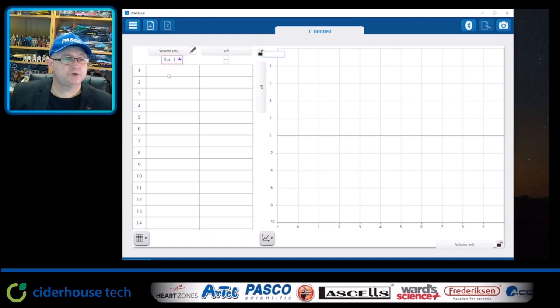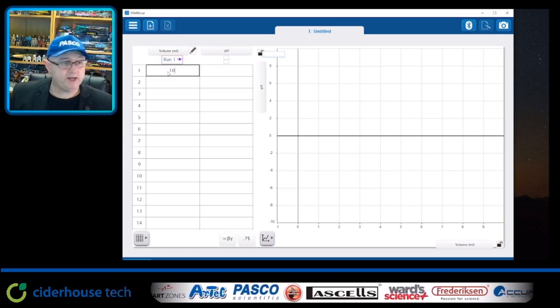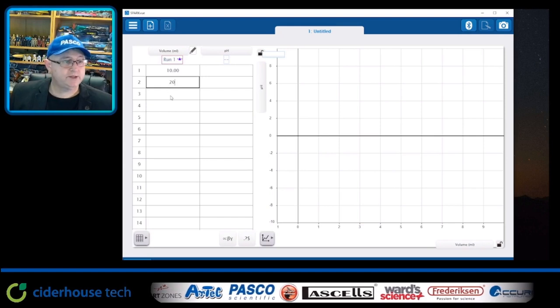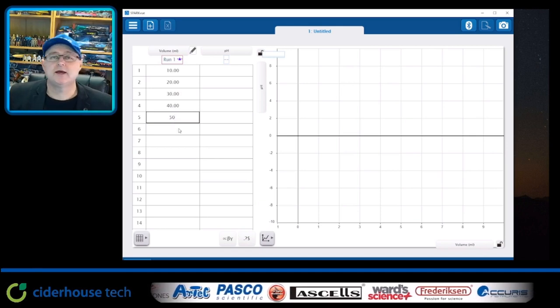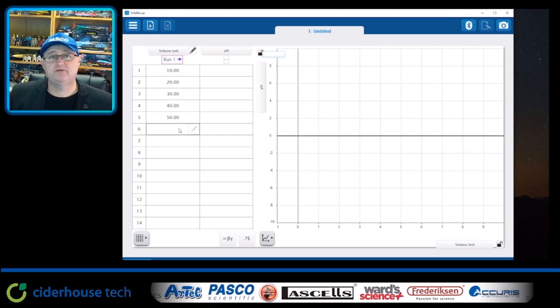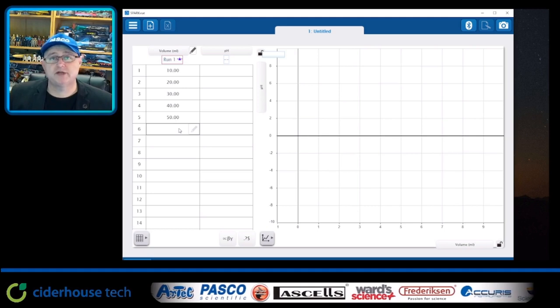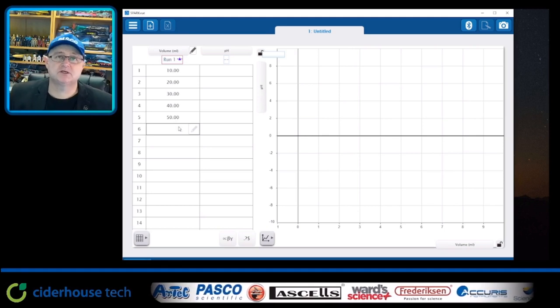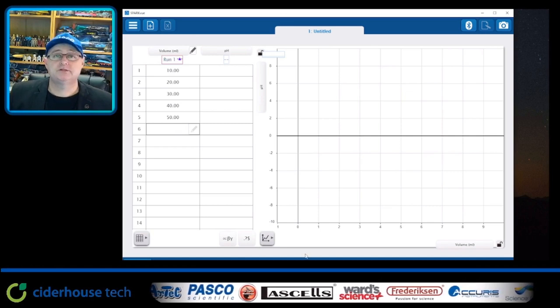But first of all, to save myself time later, because I know I'm going to do it in increments of 10 mils, I'm just going to type in here 10, 20, 30, 40, and 50. Now, if I wanted to, I could have left them blank and then added them later. If I made a mistake and actually added 15, I could just change these figures as well. But this is kind of the way we do it. Okay, so now we're ready to go. Let's go to the prac.